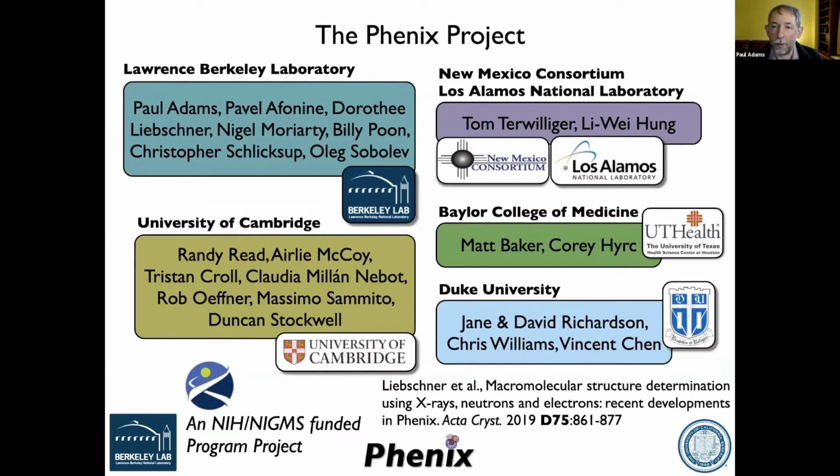Clearly, if somebody has created a nice high resolution model against high resolution data, and that's somehow related to the map that you've made, you can place that model in your map. Yes, for sure. But that is one of the reasons you have to do things like set the atomic displacement parameters, right? You can't take somebody's model that contains information that says the atoms have this amount of motion and put that in your low resolution map, because that's not realistic. That's one of the reasons you want to come up with reasonable displacement parameters.